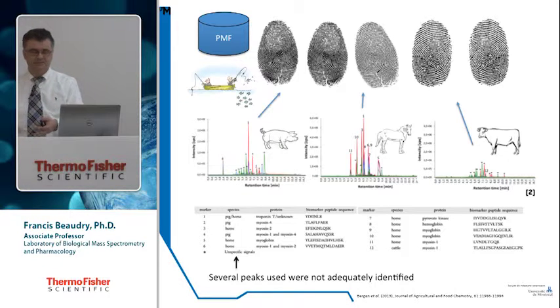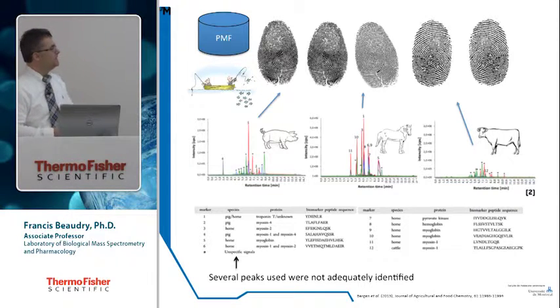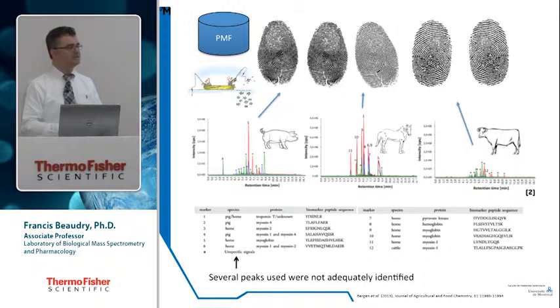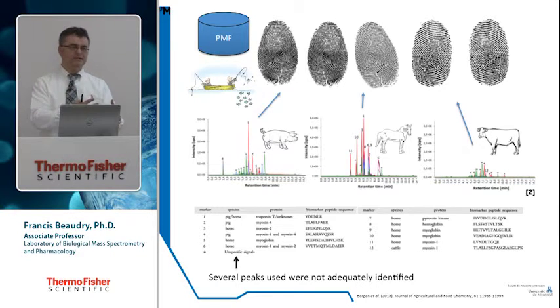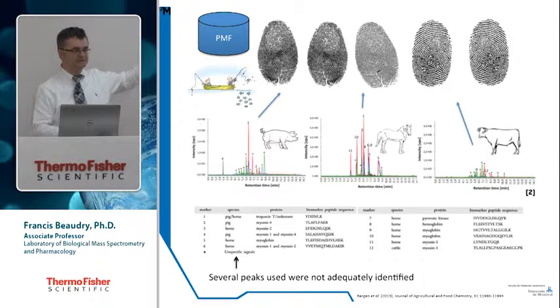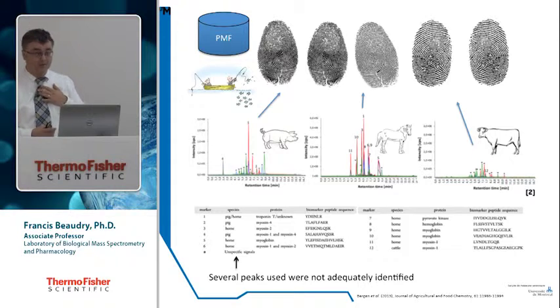How can you base speciation on an unspecific signal? It makes no sense. But this was used. Conceptually, it's a bit like a fingerprint. They use it as a fingerprint, and we know that fingerprinting is not the best way to go. Especially in that field, where you have a company that is doing adulteration to reduce the cost. They are doing economic fraud. If you go to court with this type of data, it's not going to last long. A good lawyer will destroy that right away. So that's not the way to go, not in our opinion, though.